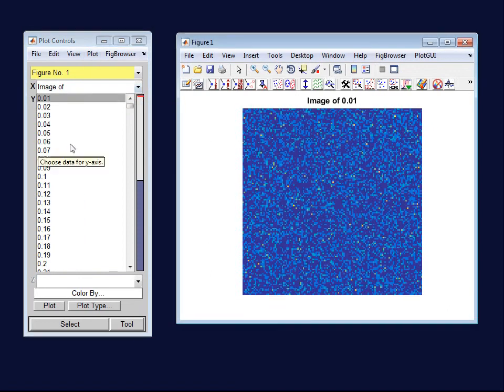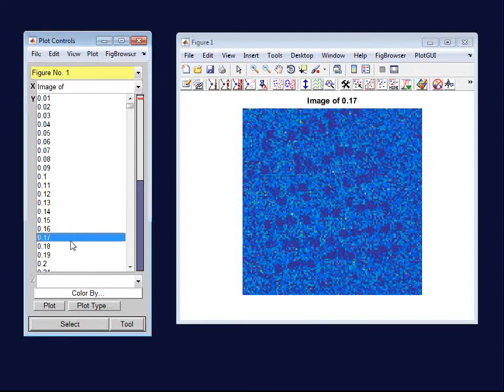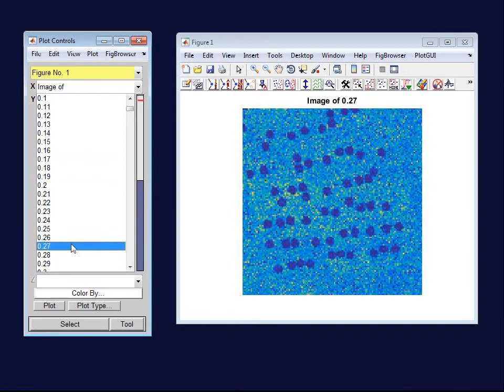And now we are looking at images from each of the energy levels. So for instance, if I come down in energy level here to around 0.27 kiloelectron volts, I can see that there's a background and the wires are not showing signal at that point. Here again we have two separate sliders because there are a fair number of variables in this data. We need two sliders to be able to access all of them. Again, the left slider accesses within the right slider's window.